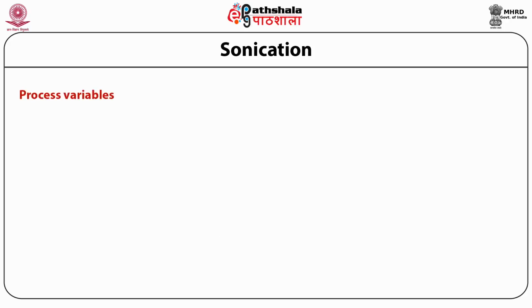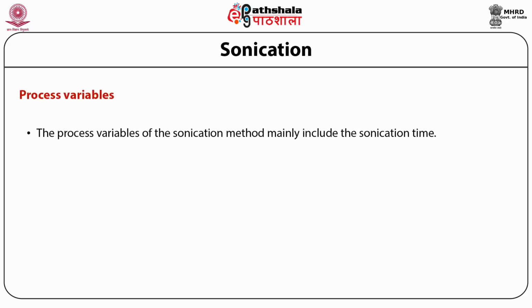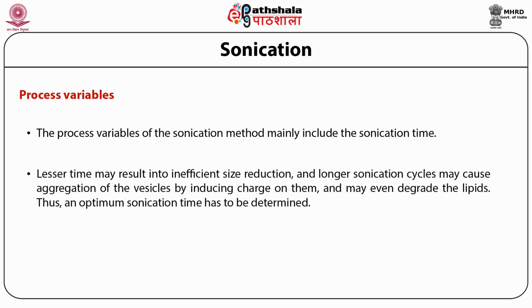Process variables during the sonication method. The process variable of the sonication method mainly includes the sonication time. Lesser time may result in inefficient size reduction, and longer sonication cycles may cause aggregation of the vesicles by inducing charge on them and may even degrade the lipids.